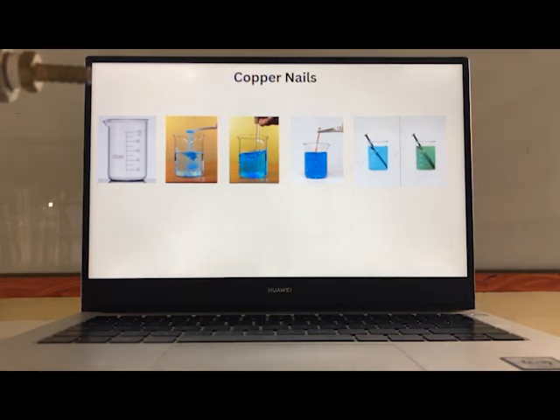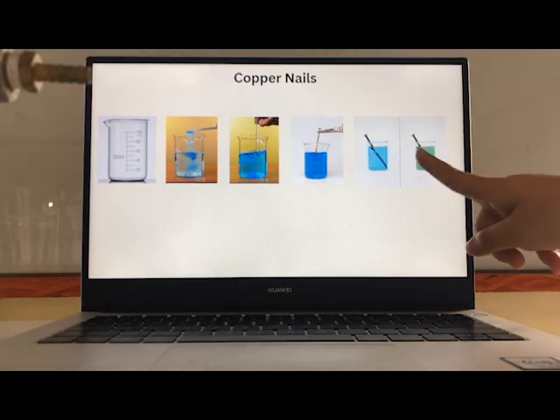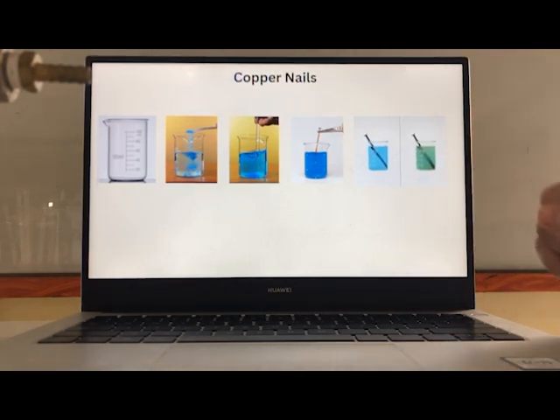It can replace copper, in color blue, and here it is in a light green color. So that is how simple the 4 student experiments assigned to our group are, and we hope you understood as we tried our best to explain what we self-studied about these specific experiments.